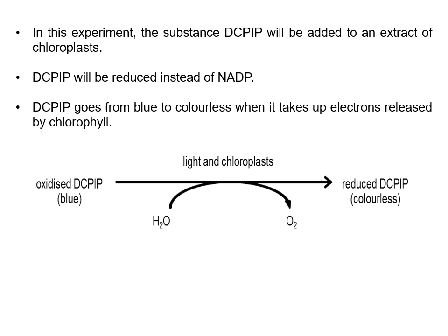Hopefully, if we have a lower intensity of light, which is what we're going to investigate, we should have the converse of that. So less light energy available, less photolysis, a slower rate of emission of electrons, and a slower rate of change, so a slower colour change.